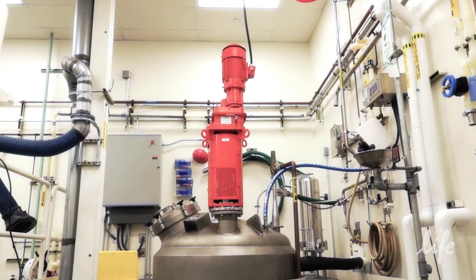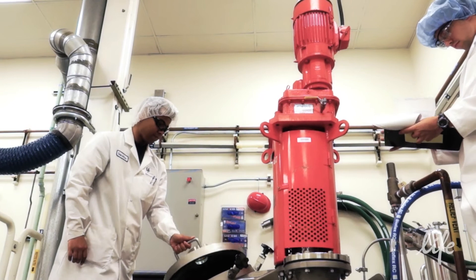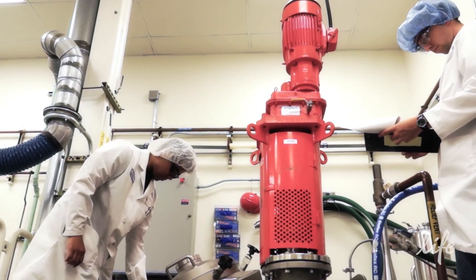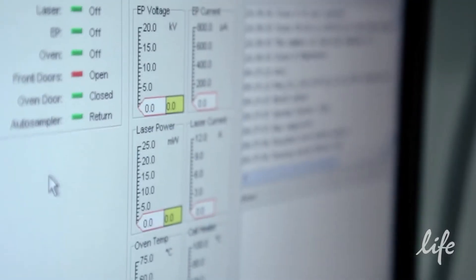This all starts with a team of passionate people in this building and really big reactors. The raw materials are flooded into these giant stainless steel reactors, each holding hundreds of gallons of materials. Reactions of this size require intelligent software and systems to continuously monitor quality and ensure batch-to-batch consistency.